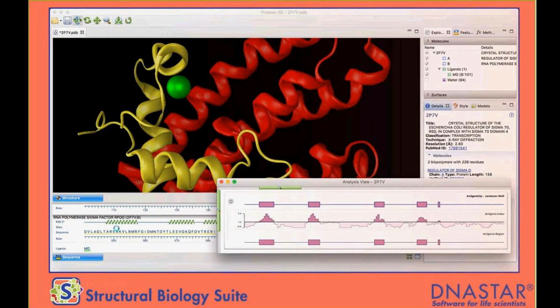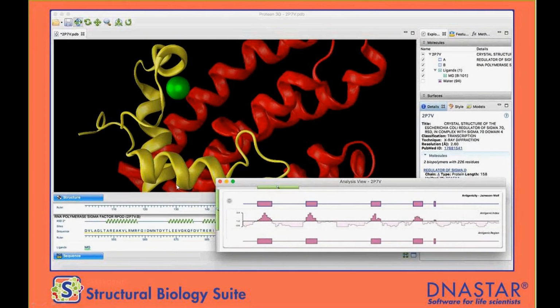And we also have a structural biology suite, which allows us to do things like predict protein structures. So we may find proteins of interest through our genomics. We can focus then on the proteins that are affected. And these are some great new tools for looking at structures, visualizing them. And of course, we have specific webinars that cover structural biology.